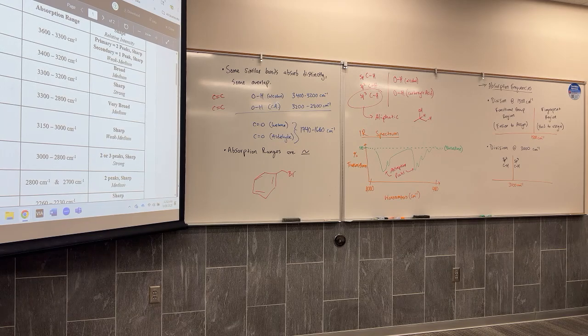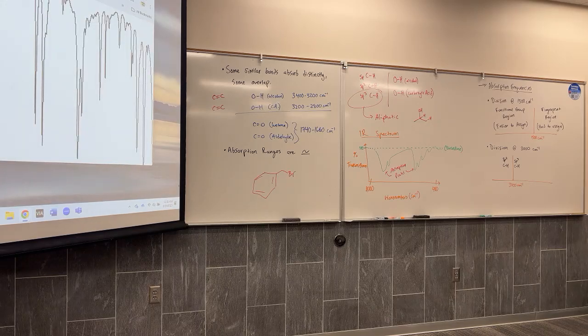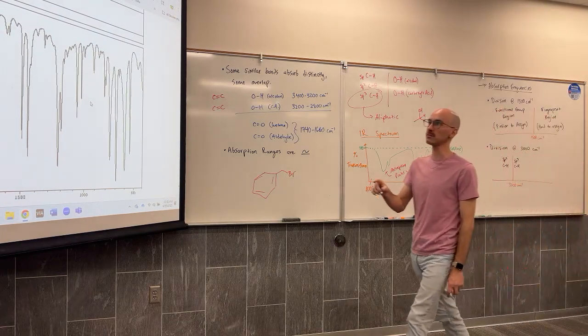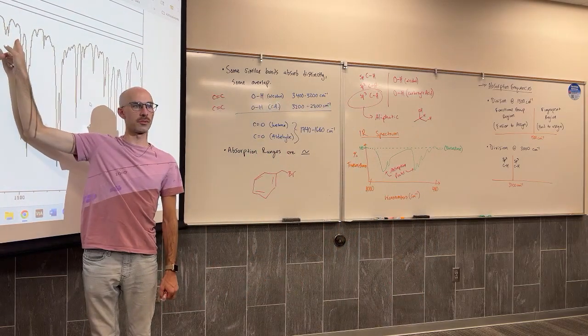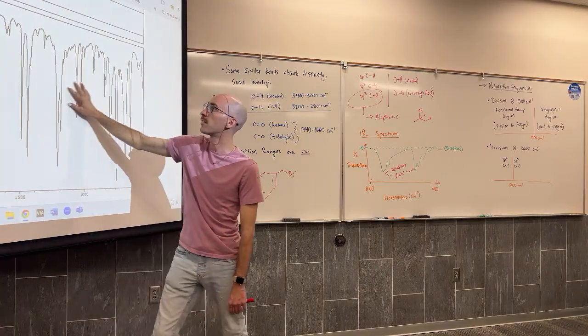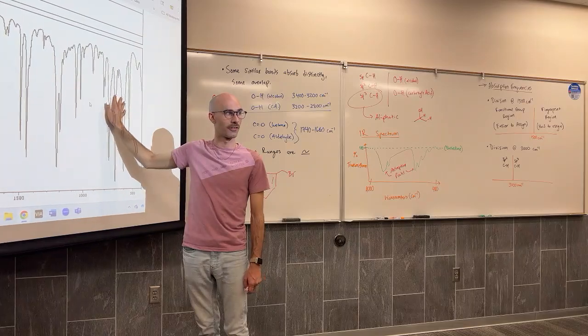You guys also noticed how if we look back at the whole structure, the aromatic overtones, the CC double bond, very small signals. A lot of other signals, very loud, and we're not even analyzing all of them.